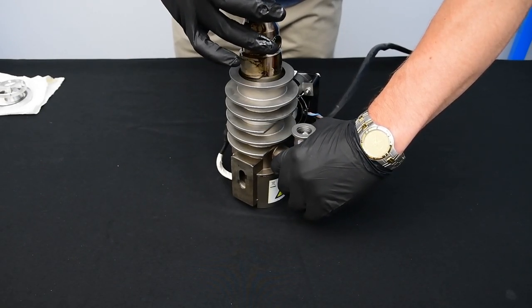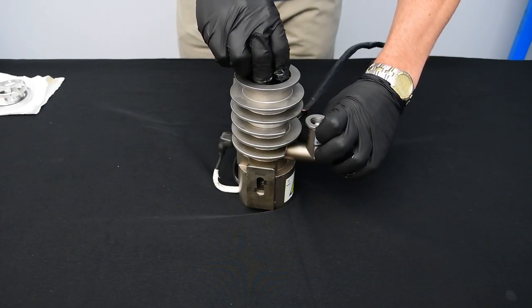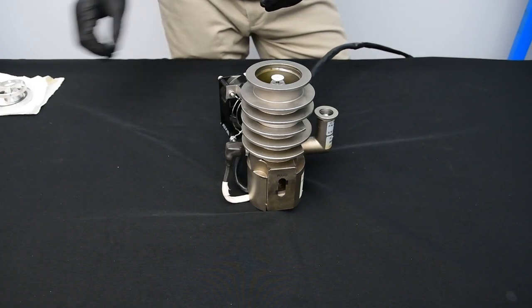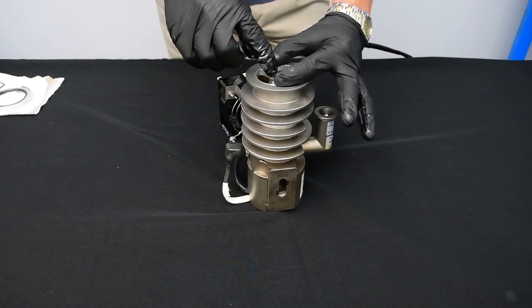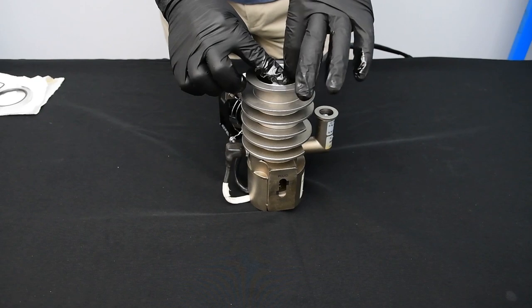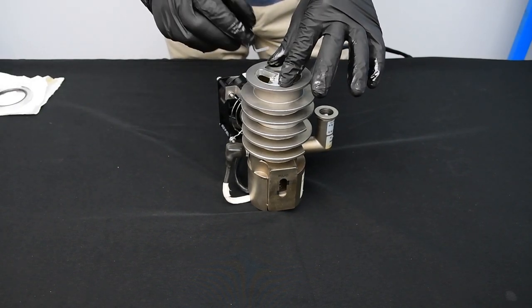Now I'm going to show you reinstallation. You're going to line up this hole with the foreline right here. Now let's talk a little bit about cleaning the inside of your diffusion pump. Diffusion pump oil is very sticky — ethanol will not cut it, so you're going to have to use acetone. After wiping everything down with acetone you're going to need to do a final clean with isopropyl alcohol in order to remove the residue. We'll go ahead and install this back in, hold it down, and tighten the screw back.